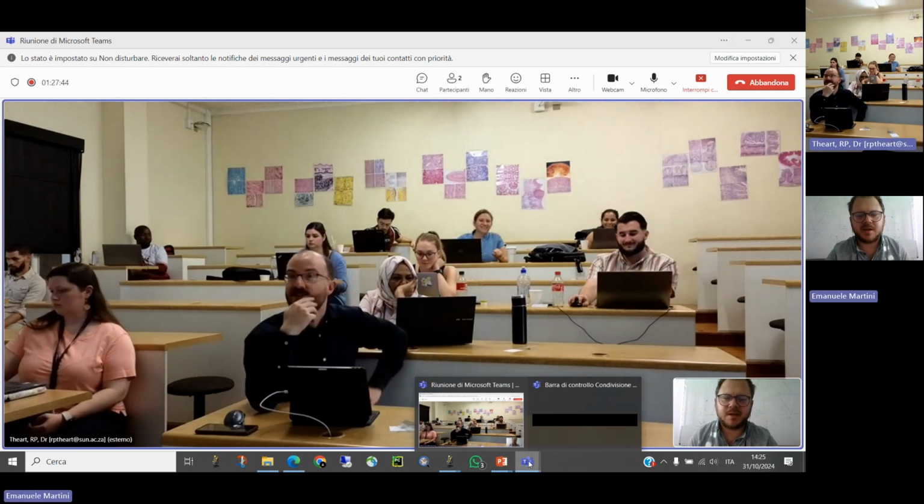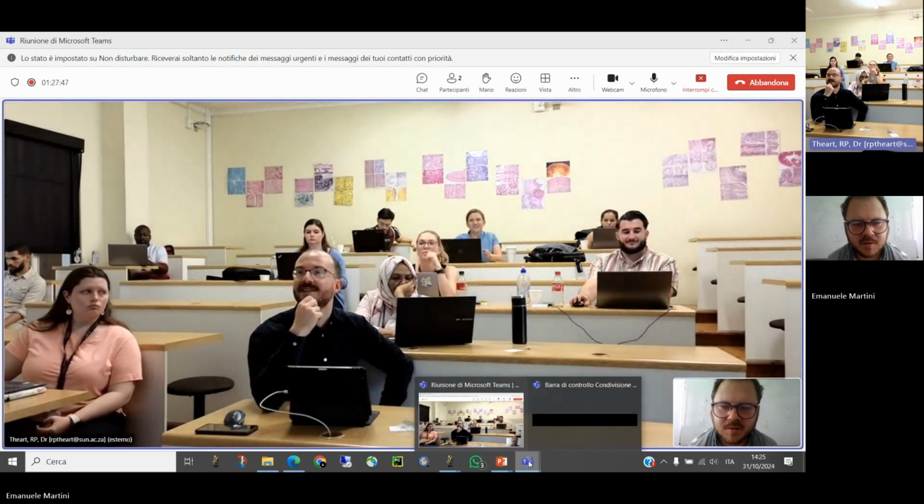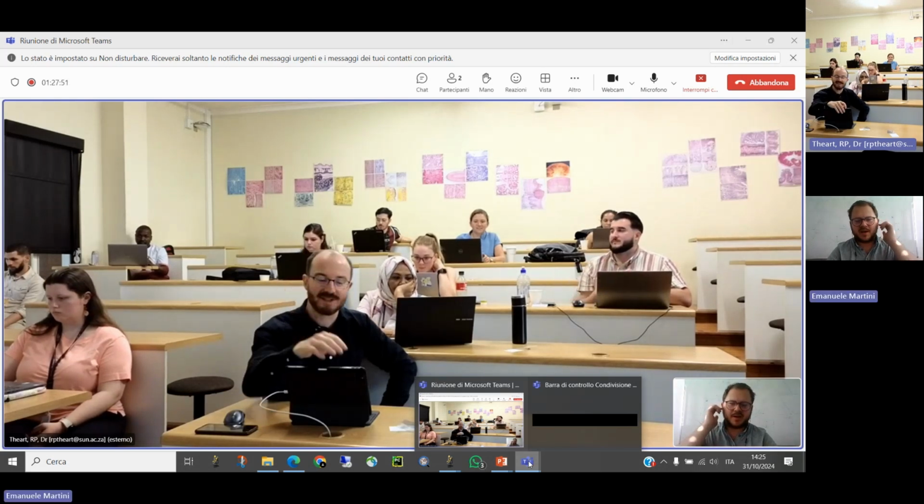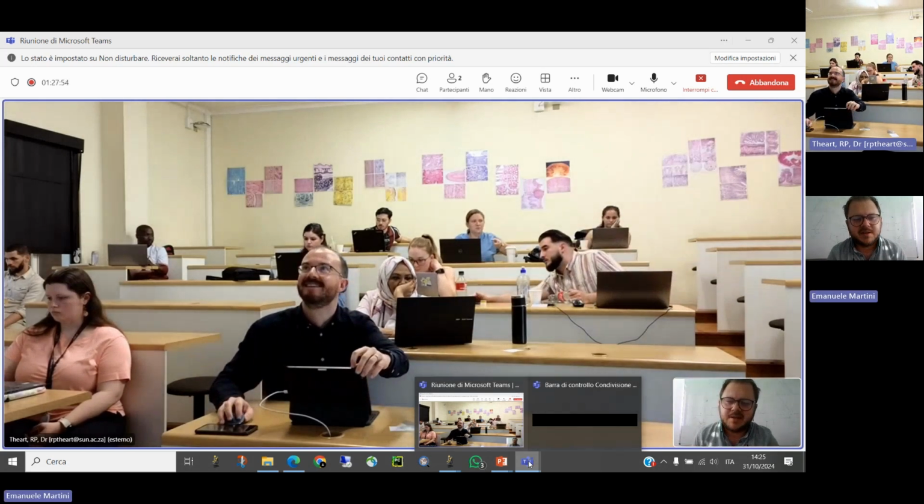From Lisa, I cannot hear. Lisa just said that everybody must just delete their graphs first, delete the extra fields. Yeah, that's so they can get to the same step. It was my error because I put the one already analyzed.